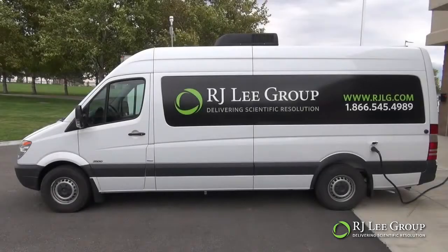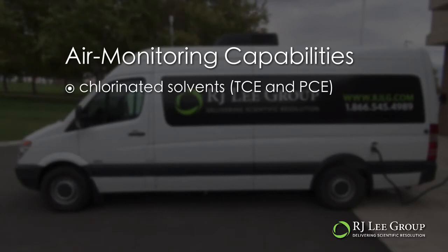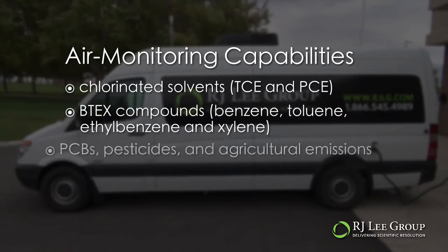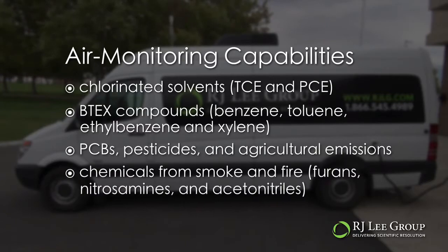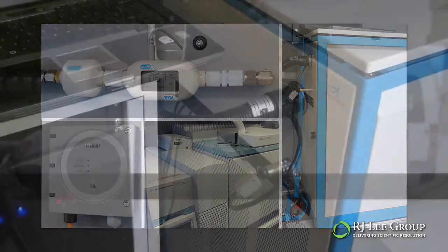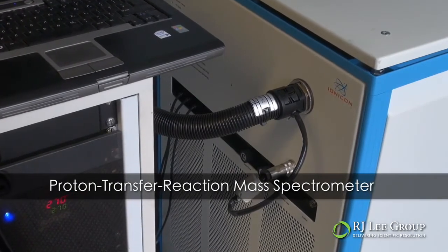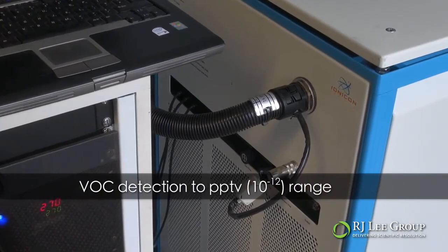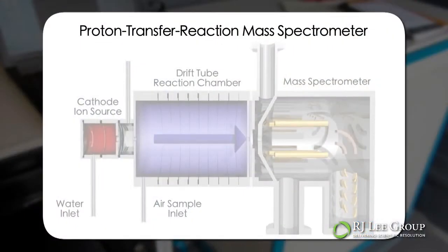The mobile laboratory can detect a wide range of contaminants, including chlorinated solvents, BTEX compounds, PCBs, pesticides and agricultural emissions, and chemicals from smoke and fire. These and other airborne contaminants are measured by a full complement of advanced air monitoring instruments. A proton transfer reaction mass spectrometer analyzes traces of VOCs as low as a few parts per trillion in real time. The PTR-MS system has three main parts.